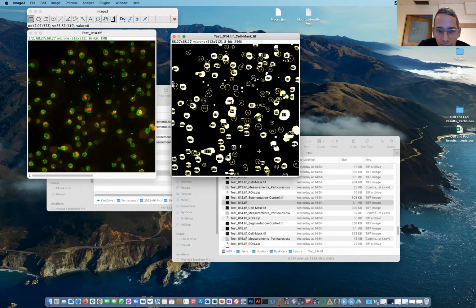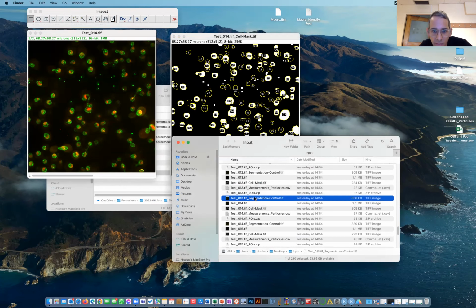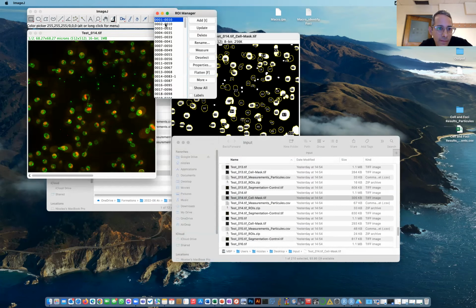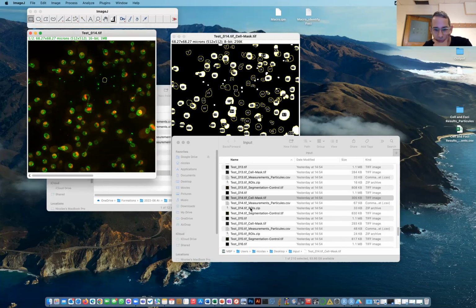So why do I have 140 and not that many cells in the other one? Well, I guess I just have many cells here. And maybe there is some mistake somewhere too. Yeah, there is some mistake somewhere, because you see that the arrays do not match, unless I opened the wrong array.